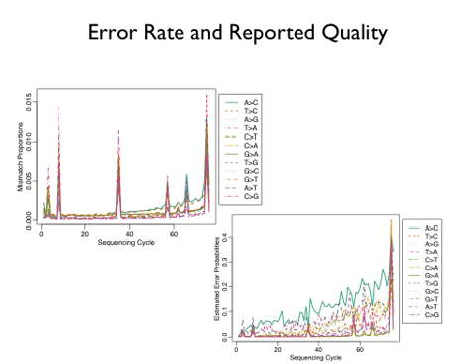And then there are these spikes, where all of a sudden there are all these errors. So remember, each cycle is a series of pictures. I think what happens there is that the image somehow went wrong. The whole image got messed up. And at that cycle, you have more errors. So you want to see this to be low. You don't want to see big spikes going up towards high levels.